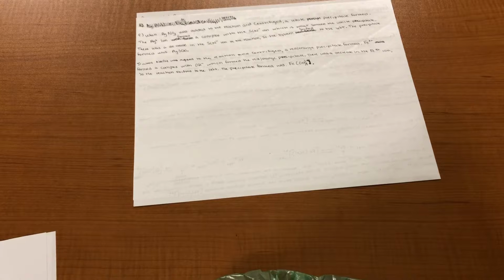When sodium hydroxide was added to the reaction and centrifuged, a red-orange precipitate formed. Iron 3 ions formed a complex with hydroxide ions, which formed the red-orange precipitate. There was a decrease in the iron 3 ions in the reaction, so the reaction shifted towards the left. The precipitate formed was iron hydroxide.